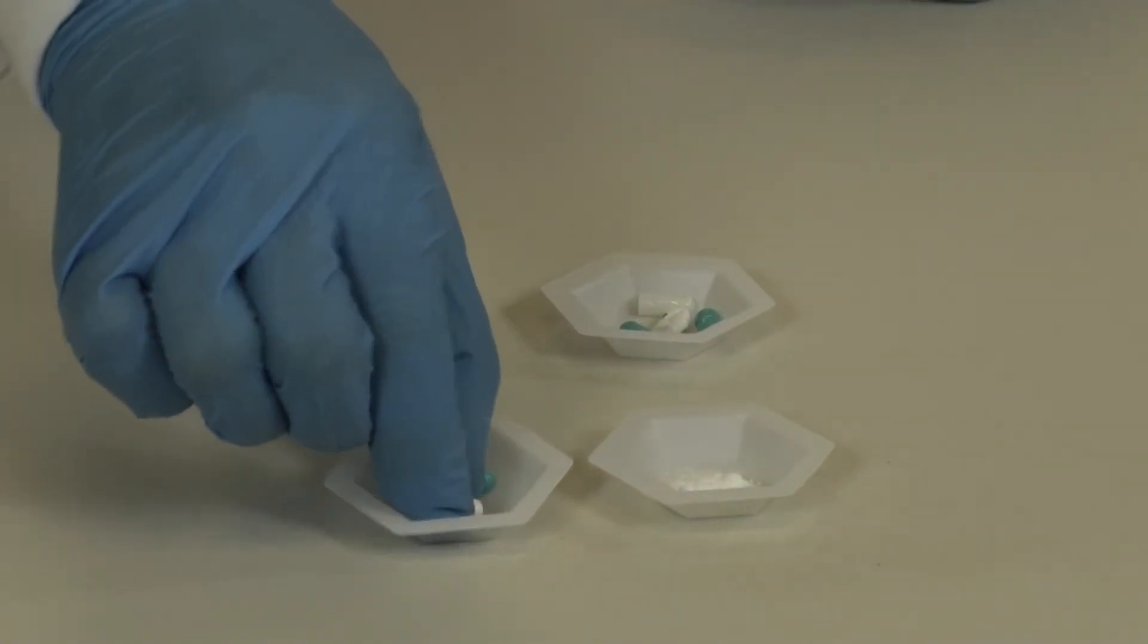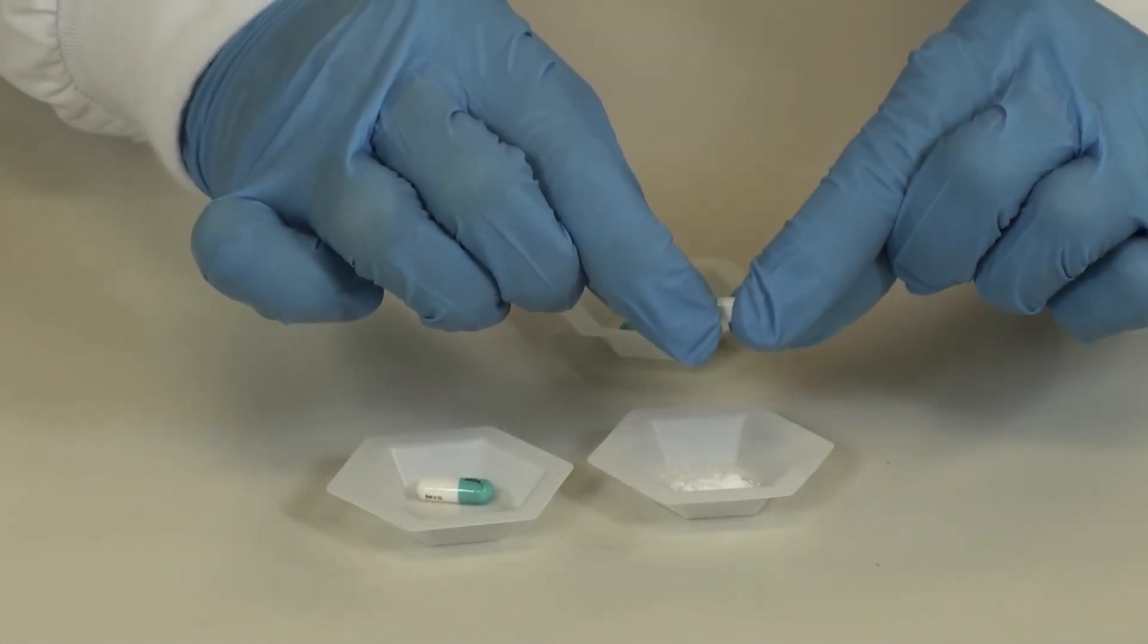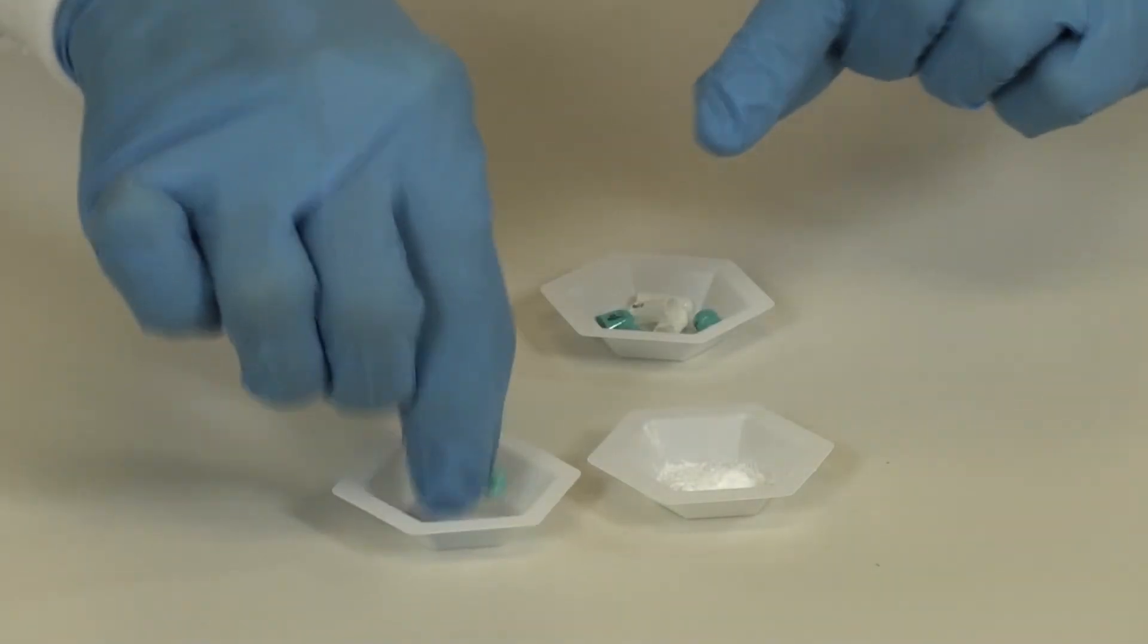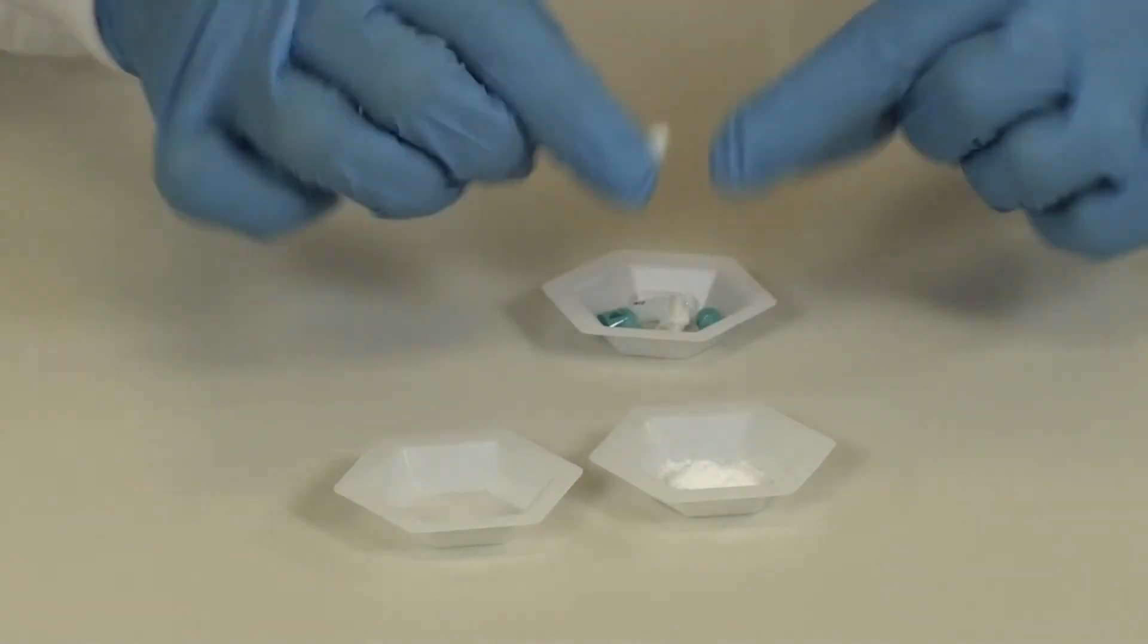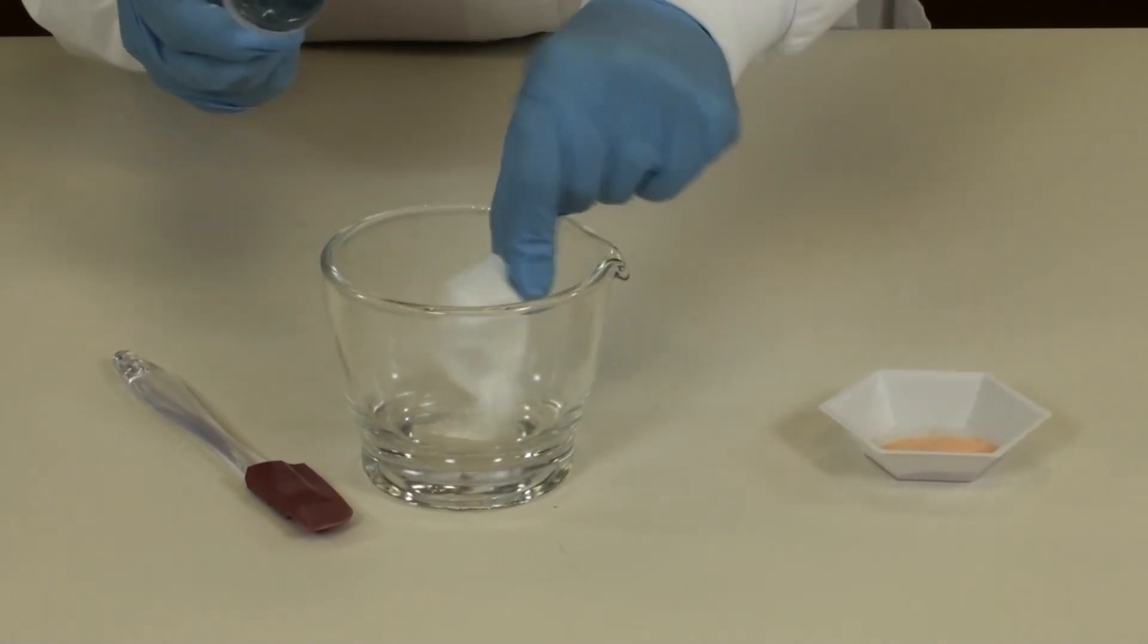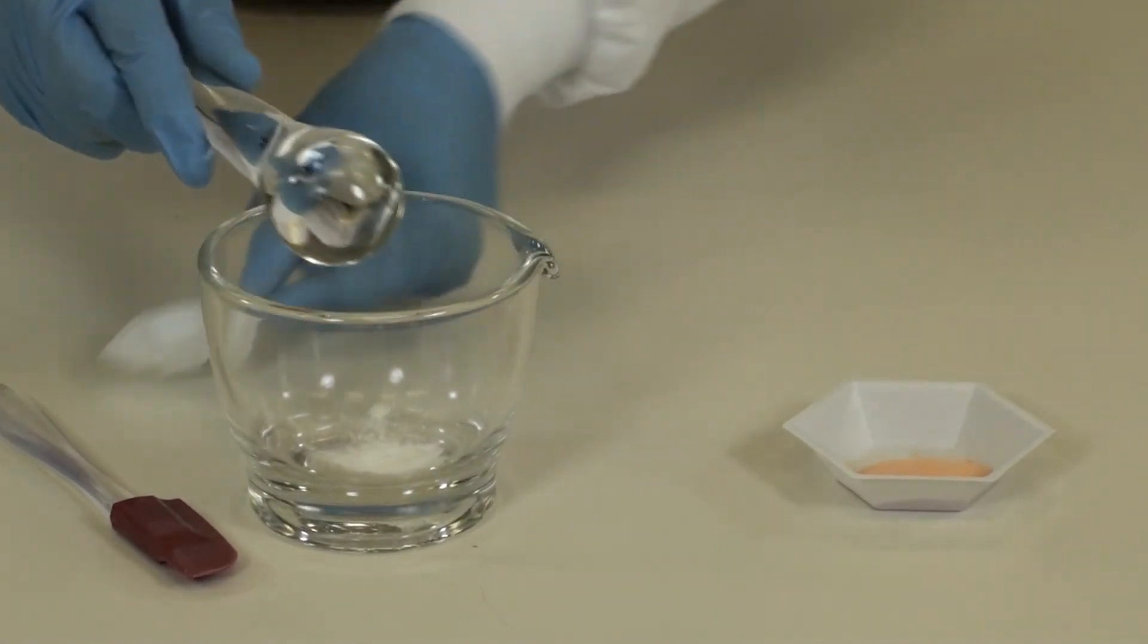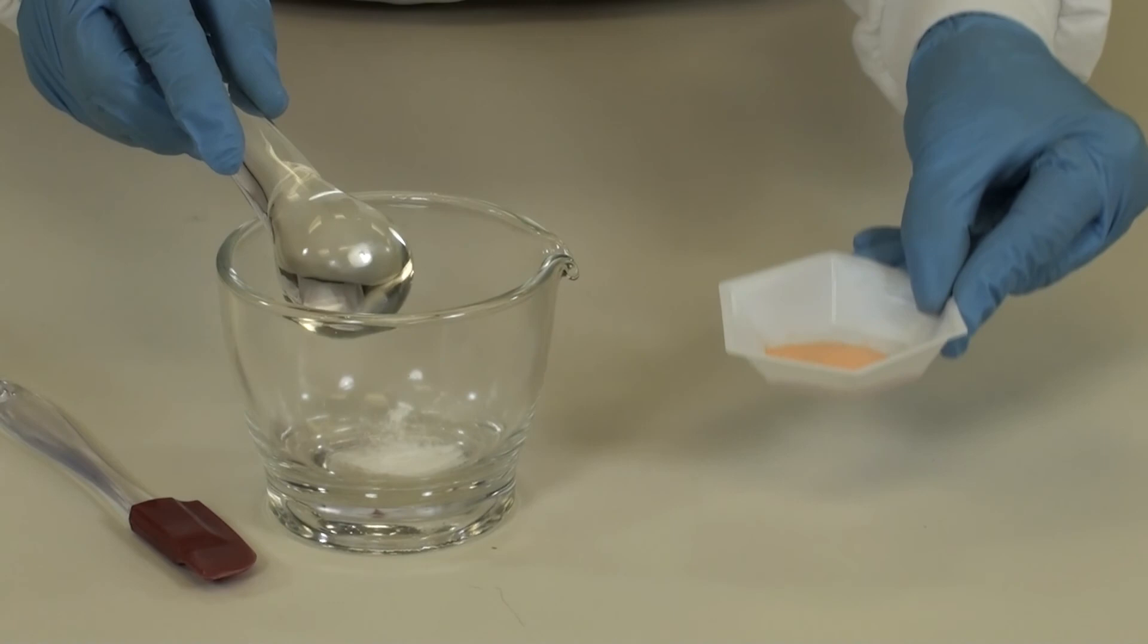Open the required number of hydrochlorothiazide capsules and empty the powder into a small weigh boat. Place the hydrochlorothiazide capsule powder into your mortar and geometrically mix the allopurinol powder with the hydrochlorothiazide.